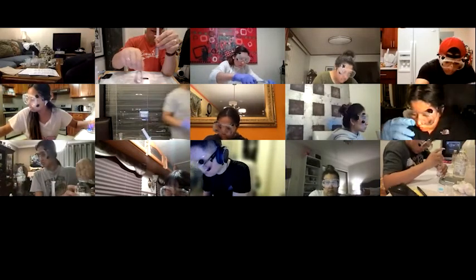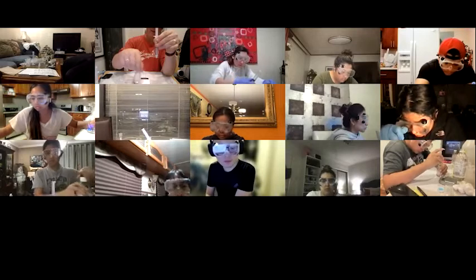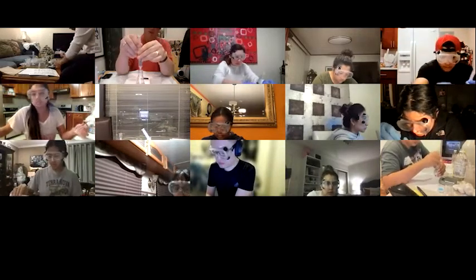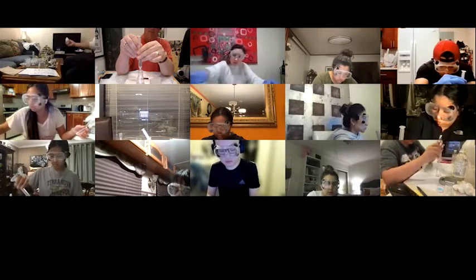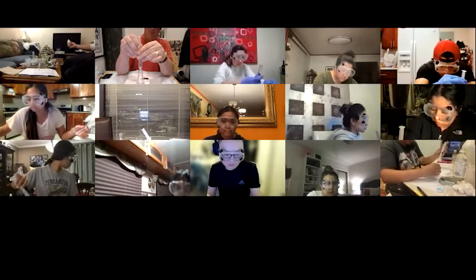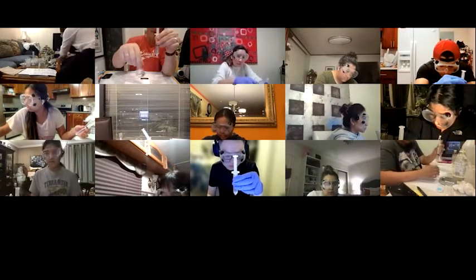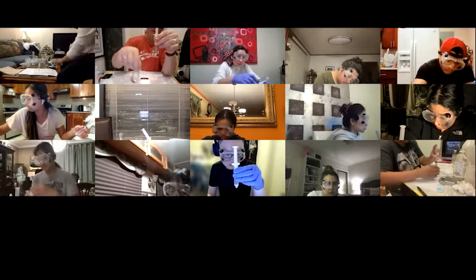If it takes you 10 minutes to do one, that's fine. Because you definitely want to go drop by drop.